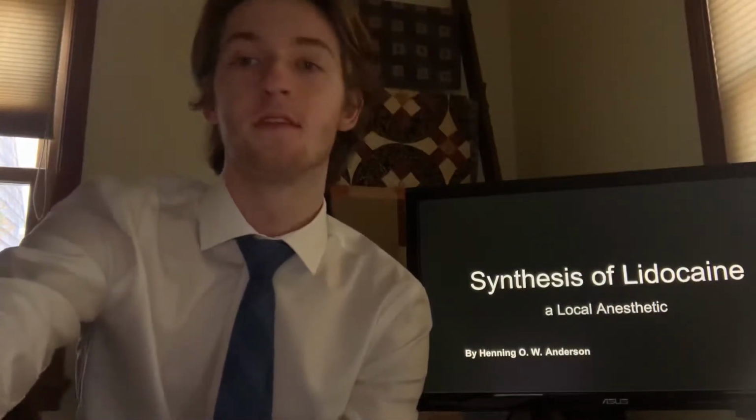My name is Henning, and this is a video journal on the experiment of the synthesis of lidocaine, which is a local anesthetic. Before I explain the experiment further, let me break it down into the 3 separate weeks and parts that we did it in.